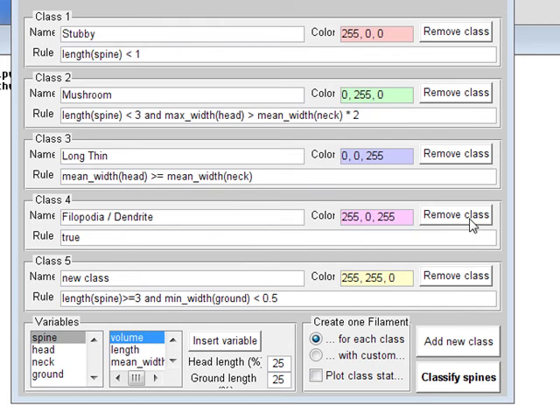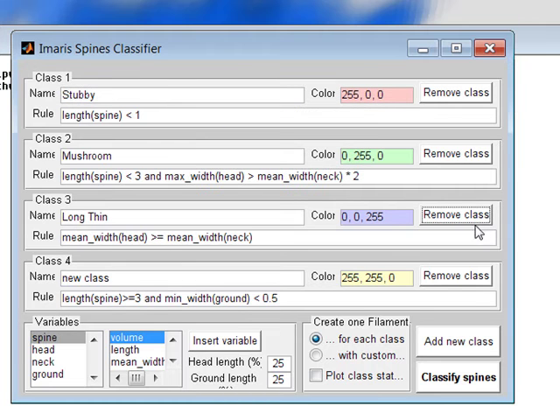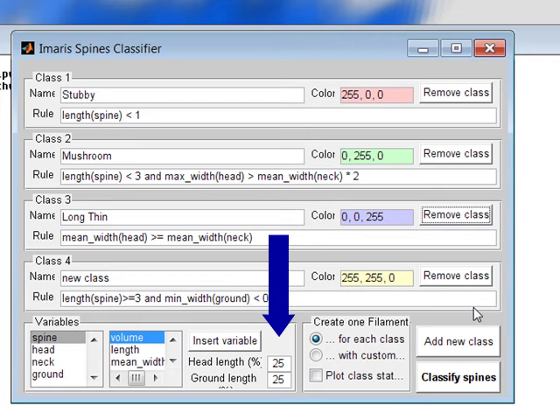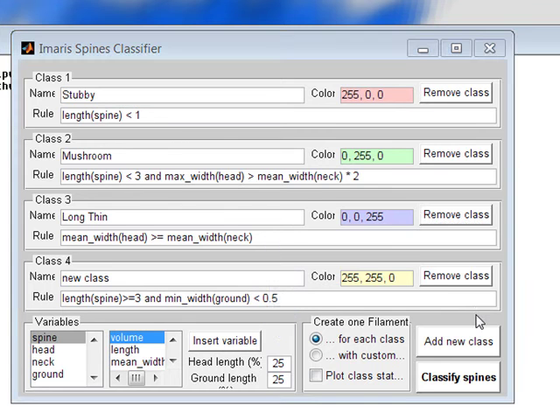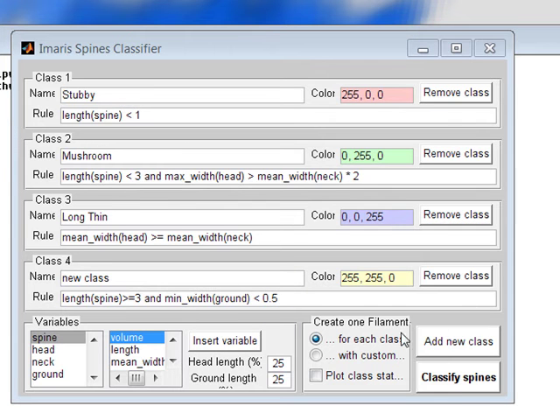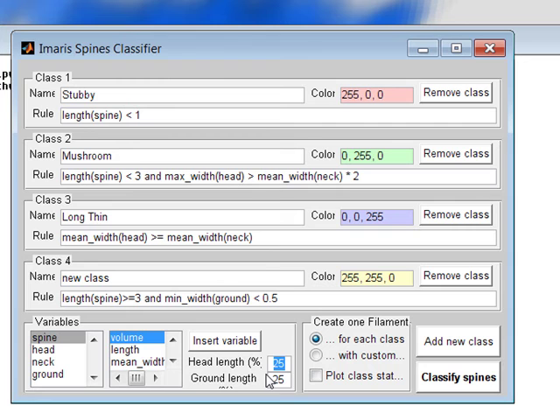To remove a class, click on the Remove Class button. By default, the spine neck length is set to be 50%, and the spine head is 25% of the total spine length. To change this ratio, you can enter the new values in the appropriate fields.